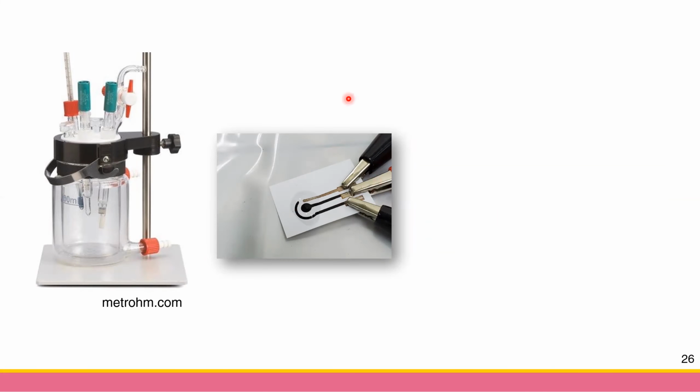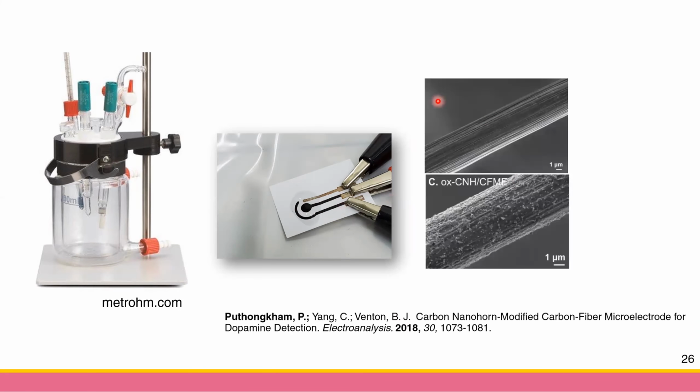In some case, I want to show you like some technology. We can further miniaturize the electrodes. And this is like my work previously from my PhD. This is carbon fiber micro electrode. Then the size is very small. The diameter of this carbon fiber is only 7 micrometer. So basically smaller than your hair.